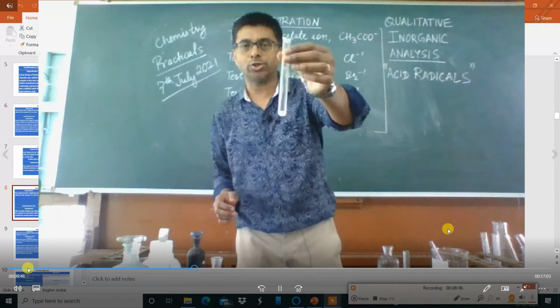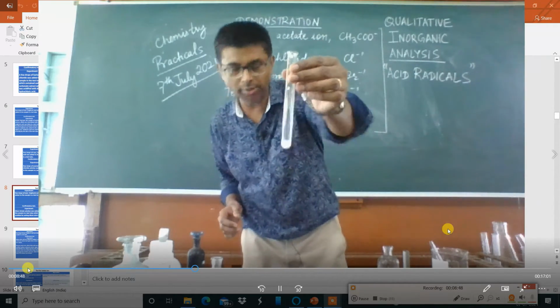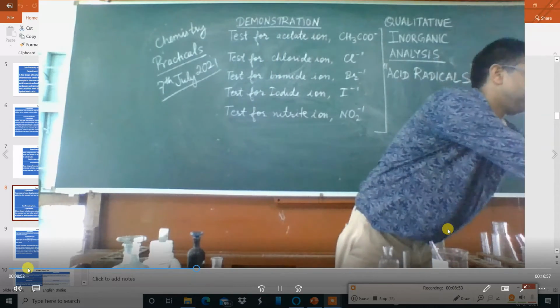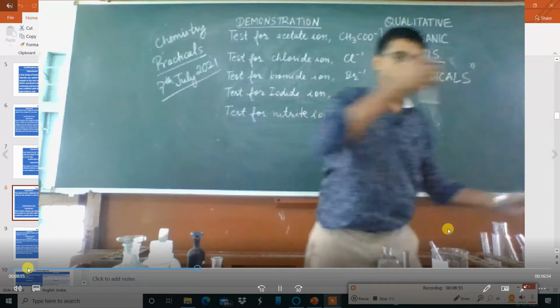Then for the confirmatory test, I have shown you the chloride sample.